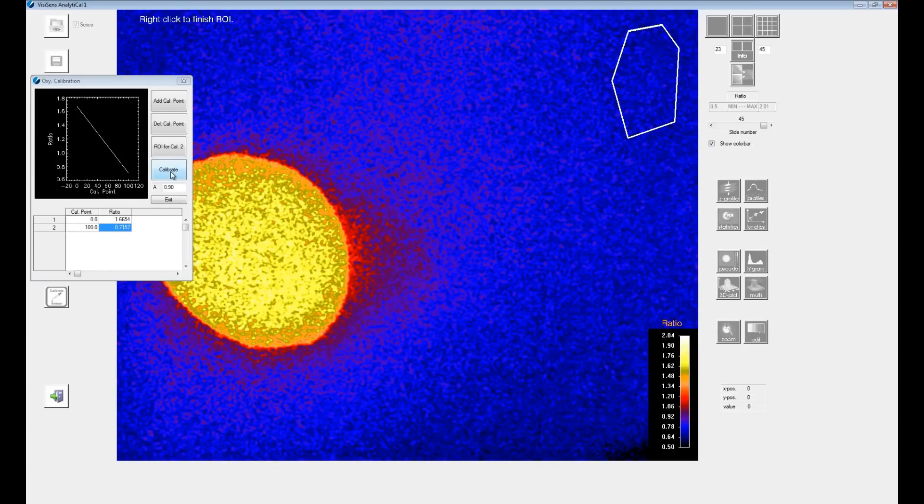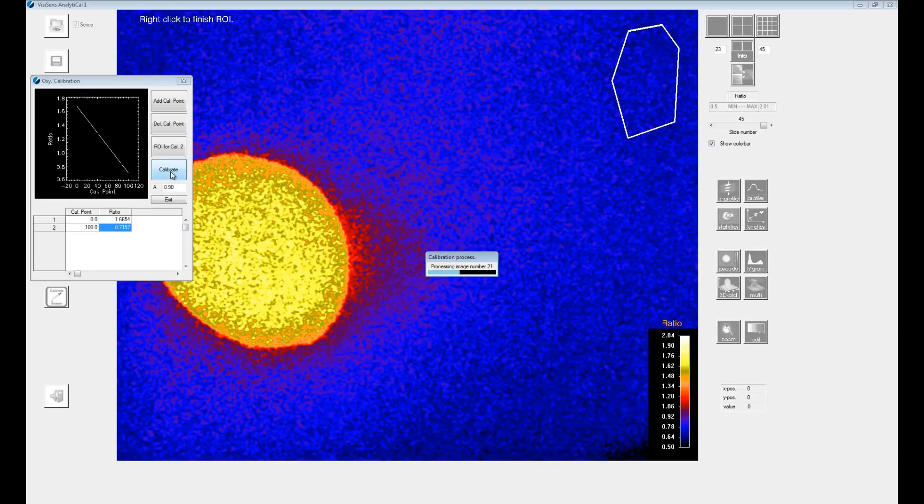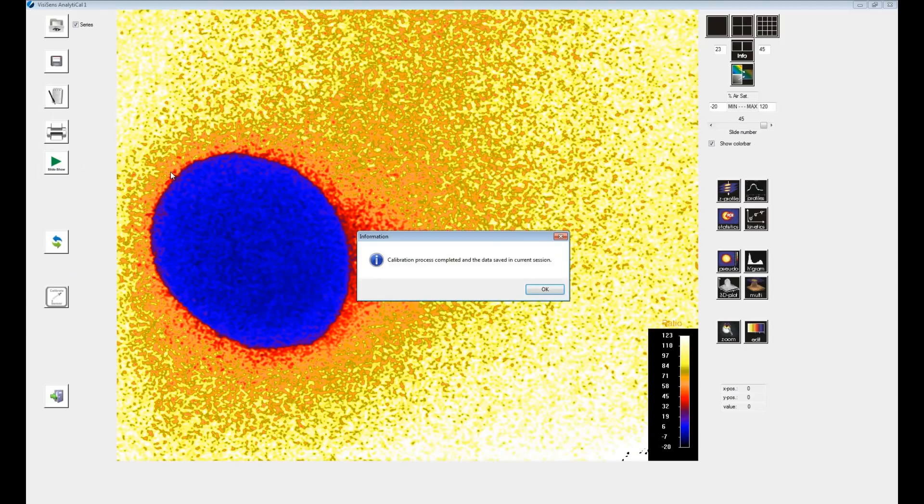Clicking on the calibrate button will start the calculation with the calibration values you just added in the dialog. The calibration data will be stored with the respective session and the images show oxygen maps now.